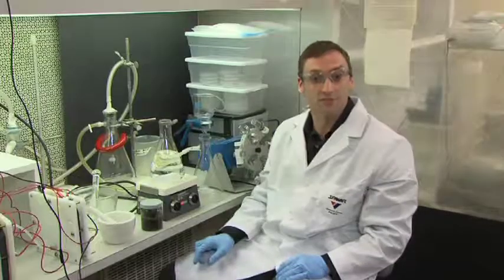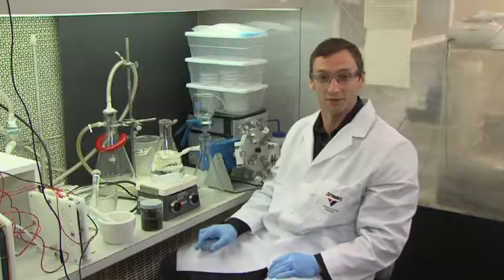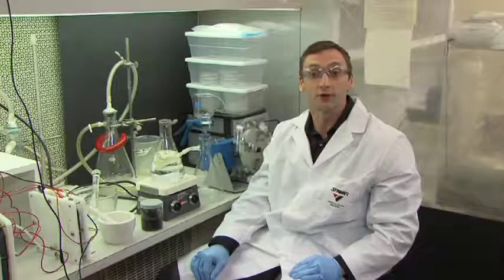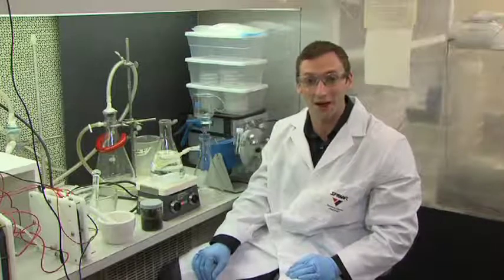Once the size limits are met, step 3, the extraction of solid material, is performed. The solid material is extracted for 18 plus or minus 2 hours with an amount of extraction fluid equal to 20 times the weight of the solid phase. The extraction fluid used varies depending on the alkalinity of the solid phase of the waste. Also, a special extractor vessel is used when testing for volatile analytes.